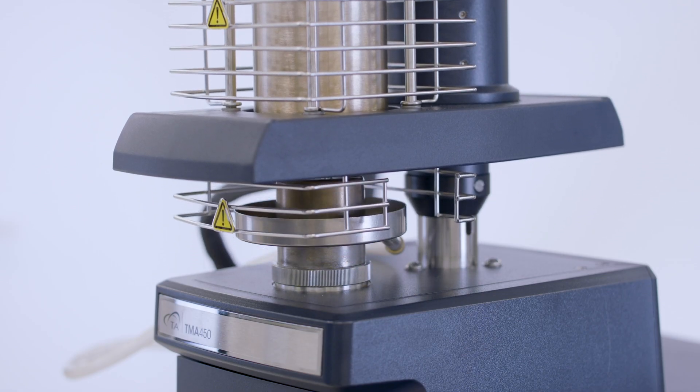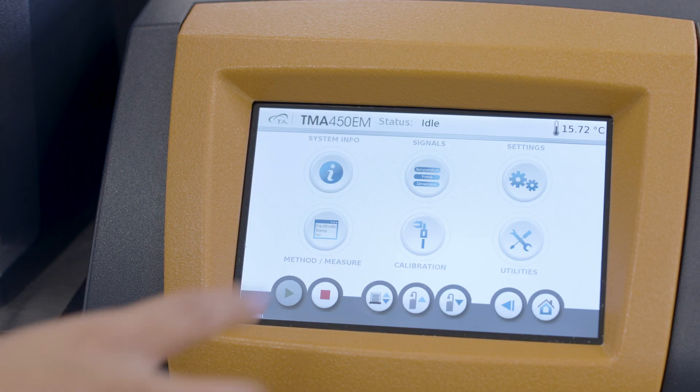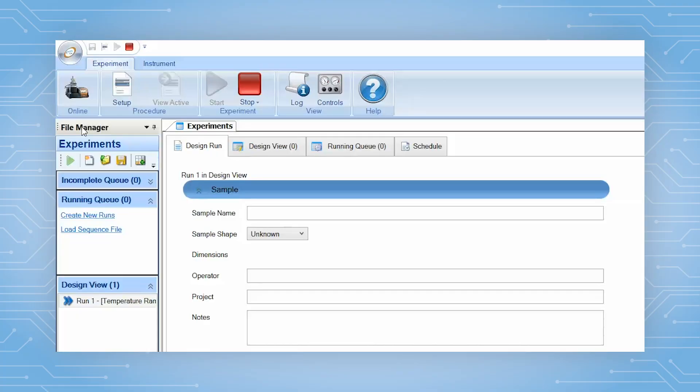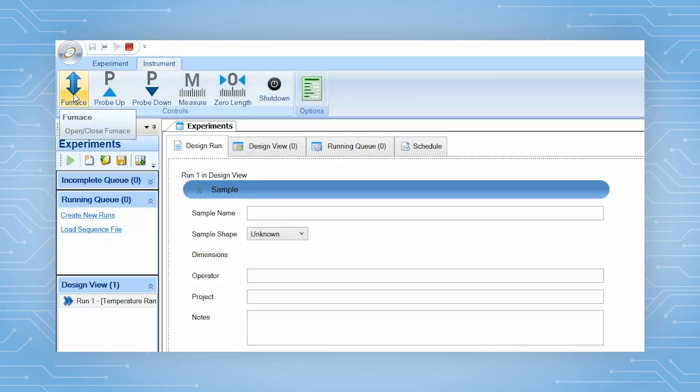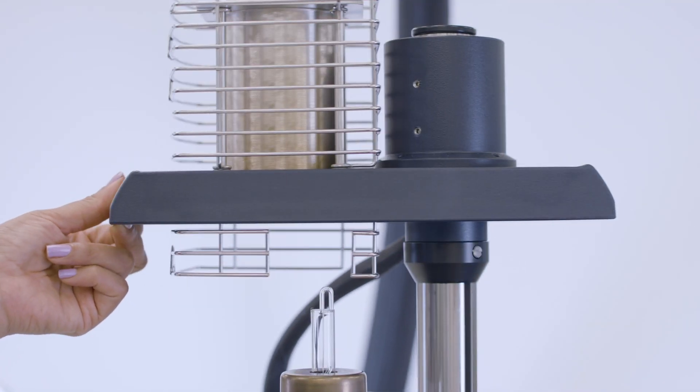To switch between probes, raise the furnace. You can do it from the instrument touchscreen or from the TRIOS software by selecting instrument and clicking on furnace. Rotate the furnace to the left to move it off to the side.